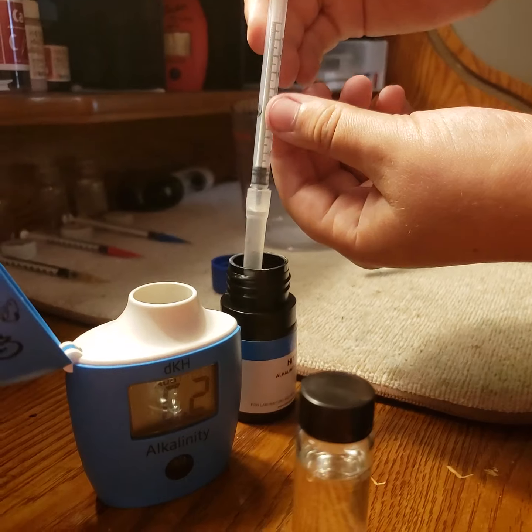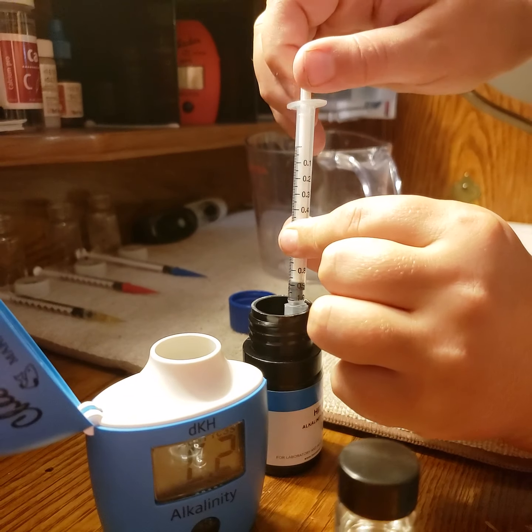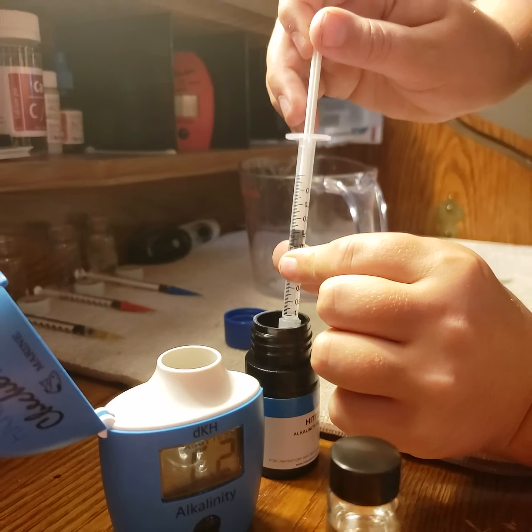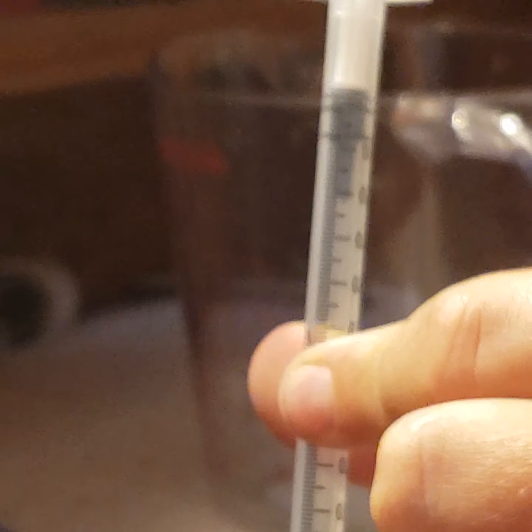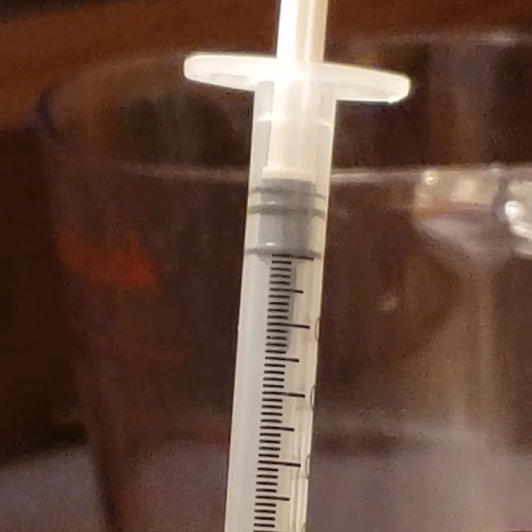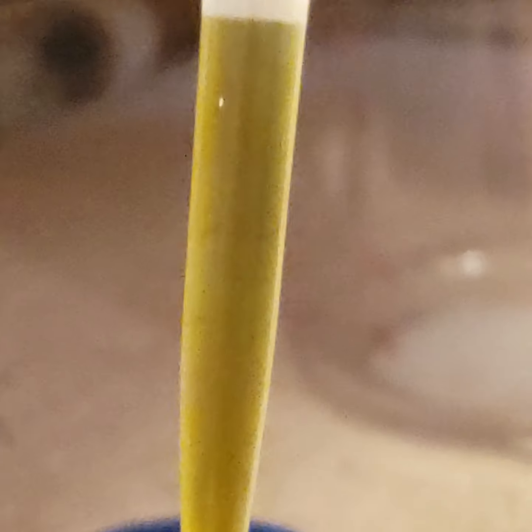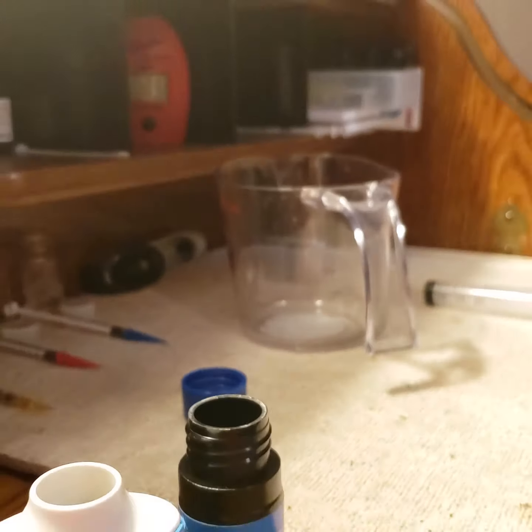Ooh, I dropped the phone. Okay. So he sticks it all the way in there. Right, it's not the nub of the syringe, it's that bottom flat line of the syringe. Hold steady for a second, Griff. See, Mom, how the bottom of the syringe, that flat part, is lined up with that top line. And pull it out, Griff, so we can show her. All the liquid's actually down at the bottom.